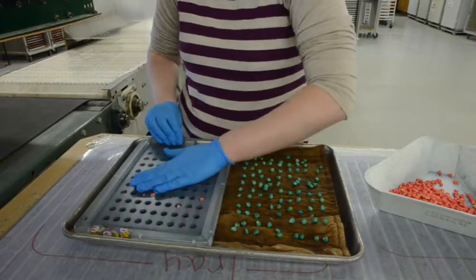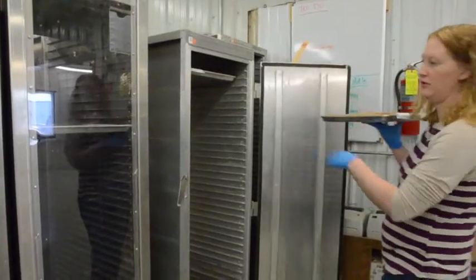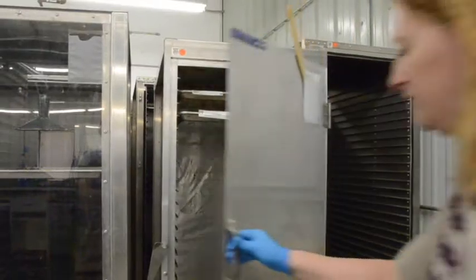Seeds are planted on trays with moistened germination paper covered in sand and allowed to germinate in the dark for about five days at 25 to 30 degrees Celsius. The reason we grow samples in the dark is because chlorophyll formation inhibits isozyme staining.